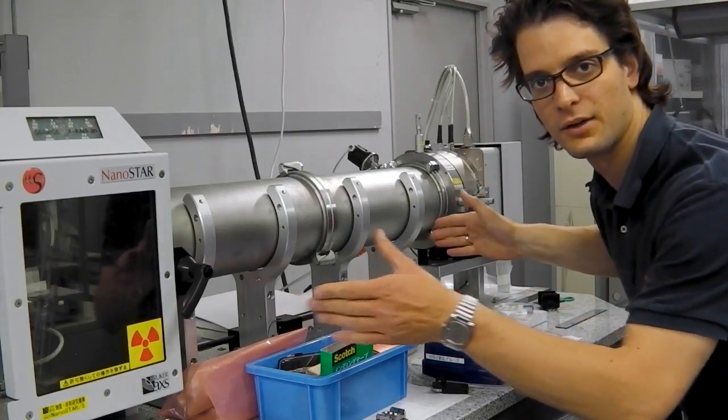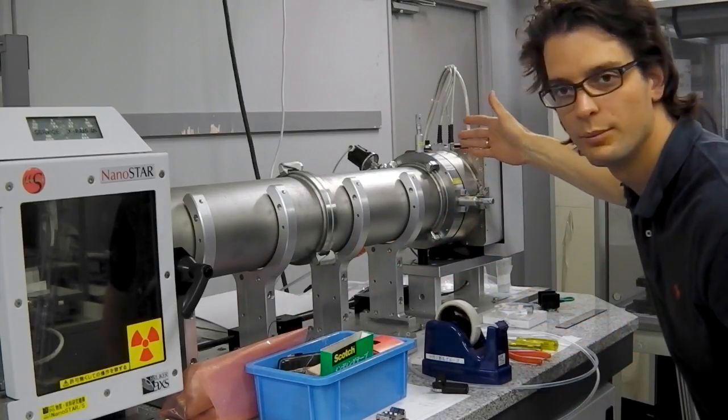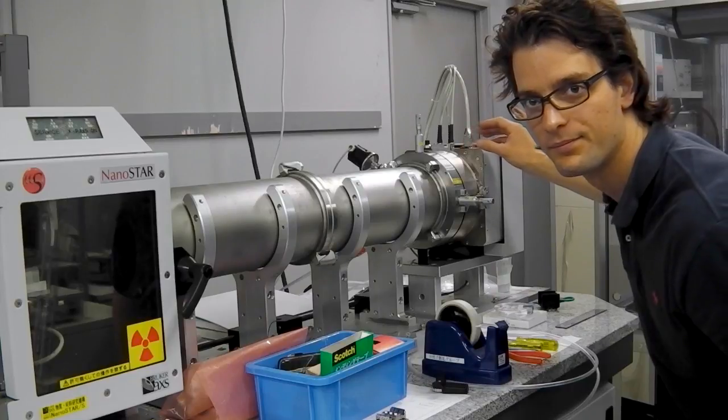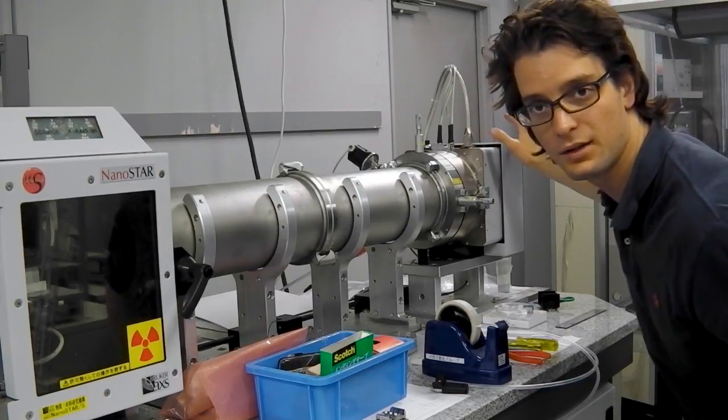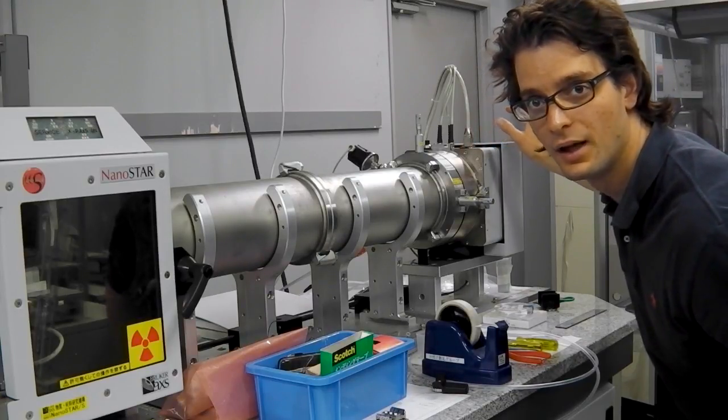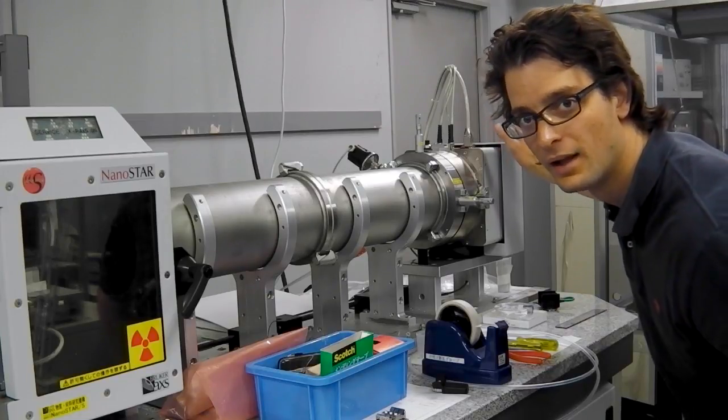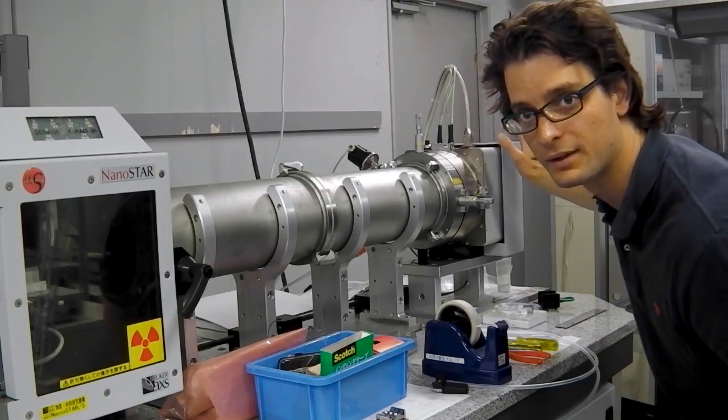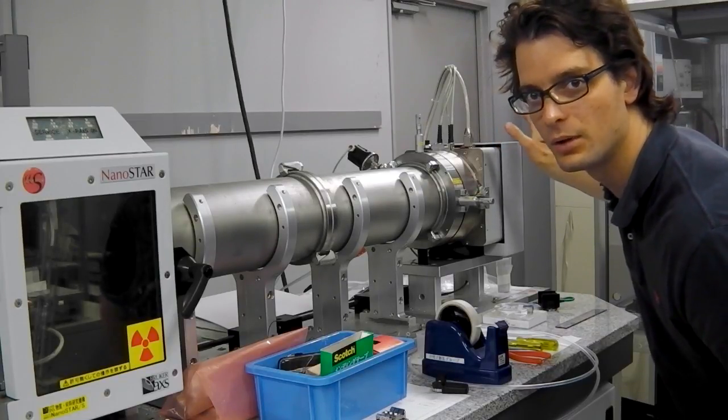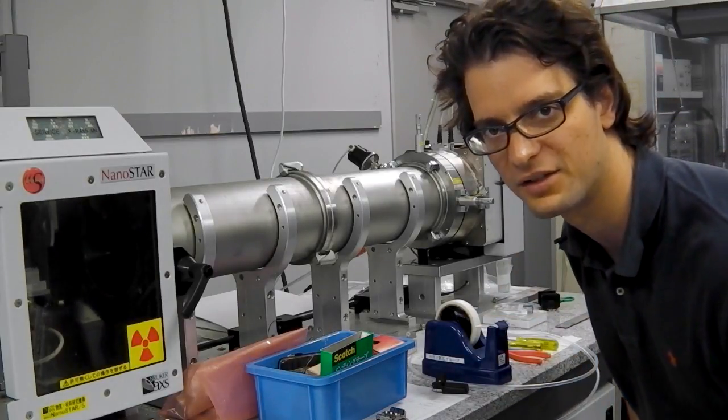Now this particular instrument doesn't have an exit window but has the detector mounted directly against the vacuum. This detector is a wire detector, which I've complained about before. It is an old-style detector, and it can give you good data, but you need to be very careful with your data corrections.